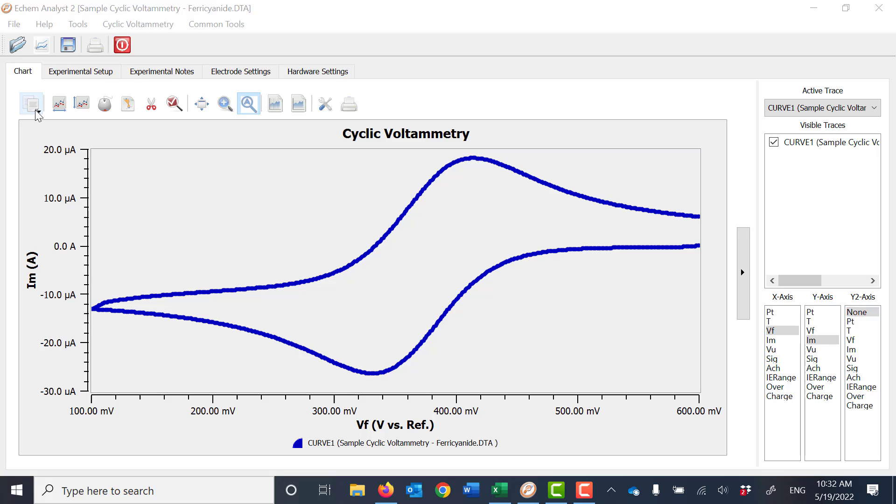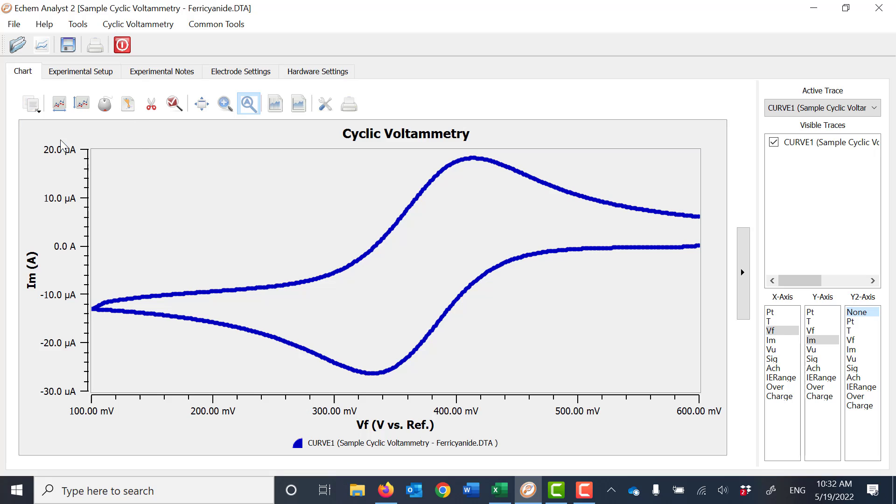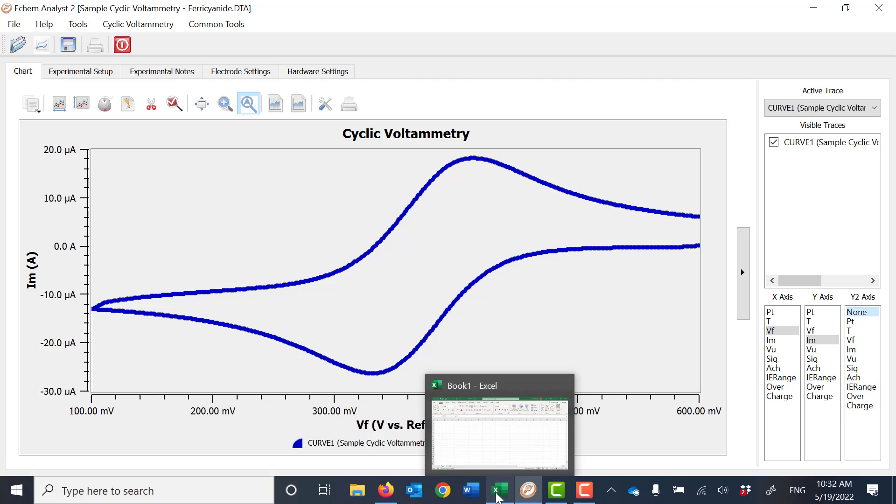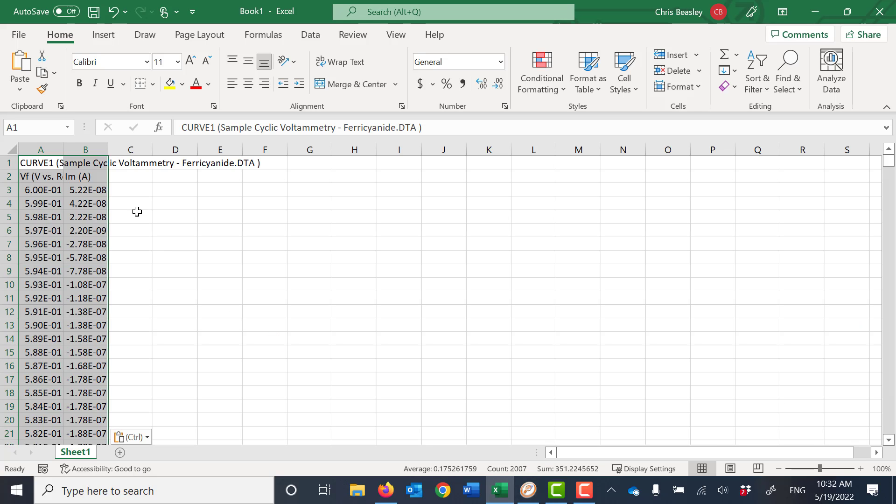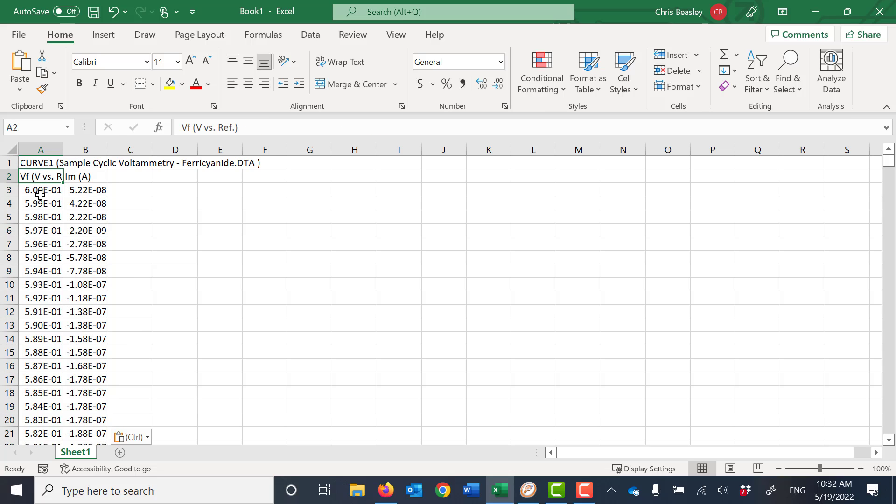I go over here to the copy to clipboard button, click on it, copy as text, and I go to whatever plotting program I want to and simply paste it in. And you can see it pasted voltage and current.